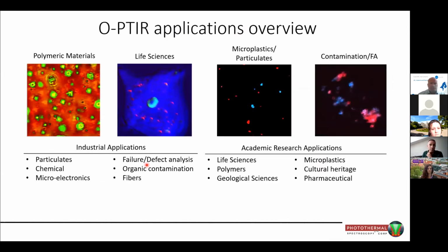Okay, if I'm going okay for time, I'm going to take you through a few application examples. I won't go into too much depth because our guest speakers will do most of that. But like with FTIR, like with Raman, the application fields are extremely broad. That's good for us, but also presents some challenges because it's, well, where do you target, where do you go? For us, it's been very much life sciences, and that's also reflected by our speaker list today, but things like microplastics, polymers, there are some really cool pharmaceutical type applications. Failure analysis in the electronics industries have also worked out really quite well for us.